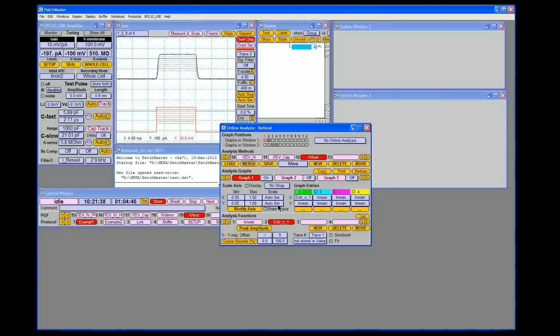So the easiest thing is to specify an order series axis. What this will do is, after all of the sweeps in a particular series have been acquired, it will take a min-max of these values and then compute the axes automatically. But this means that the plot here will not occur until after the acquisition has terminated.